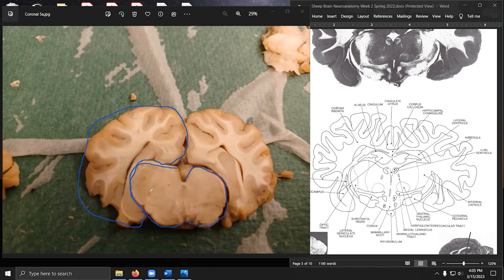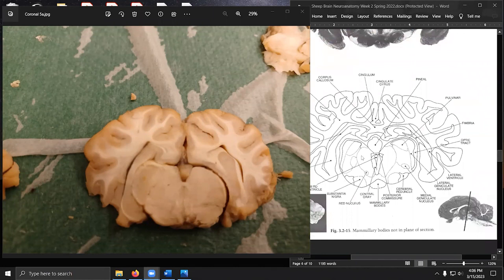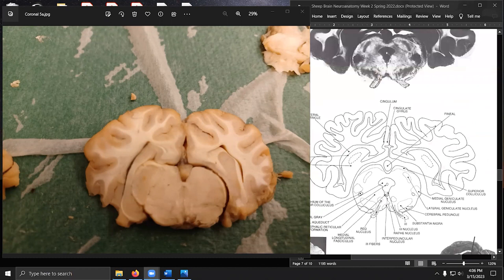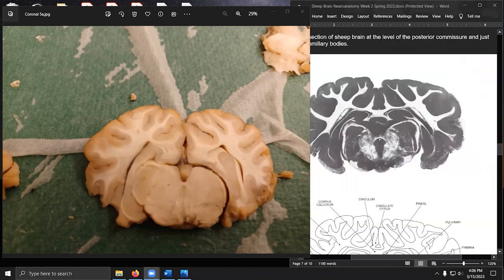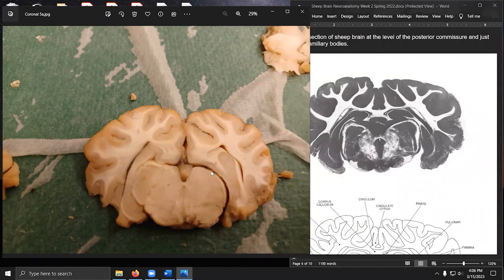So that's how I can figure out that this is more anterior, based on the heart shape that we see in this picture compared to when I scroll down. It still resembles a little bit of the heart shape here, but if we take away the mammillary bodies, we'll actually see more of that kidney shape. And then we definitely see it a lot more here. So again, this being a lopsided cut makes it a little hard to pin exactly which page it's on, but a lot of the features that we're going to be highlighting here exist on multiple pages. So let's give it a go.